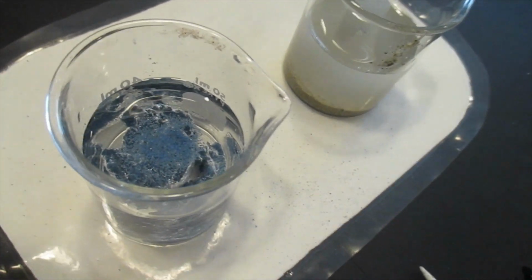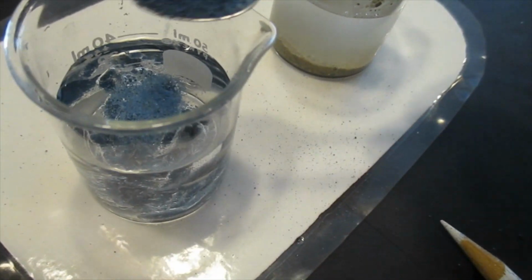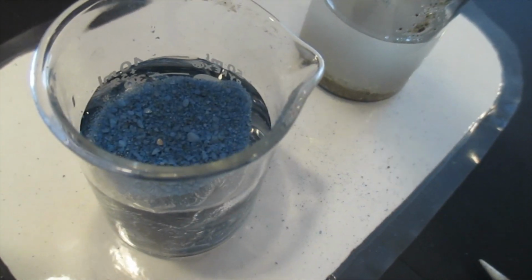Because it's heavy. Okay, I'm gonna show something here. I'm gonna sprinkle some in here. And then I'm gonna use a micro pipette.